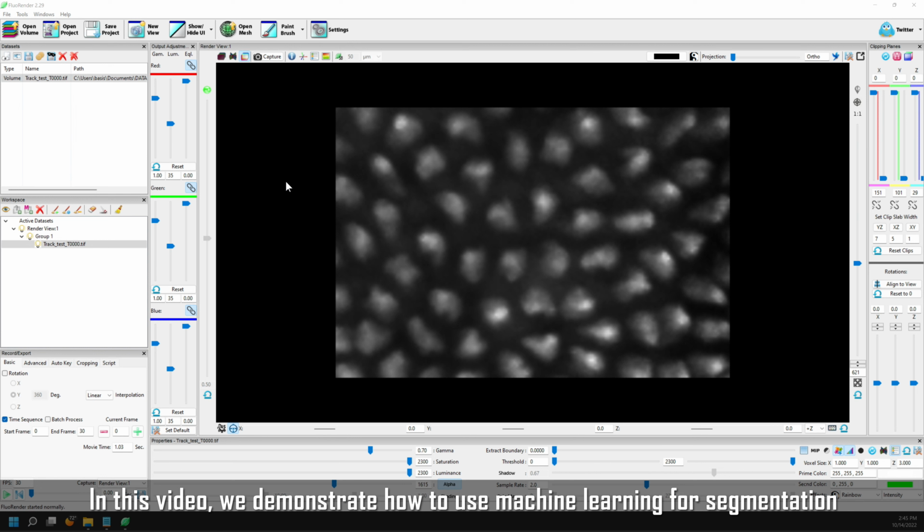FluoRender tutorial. Machine learning for component generation. In this video, we demonstrate how to use machine learning for segmentation. We loaded a time-dependent dataset with cells that need segmentation.